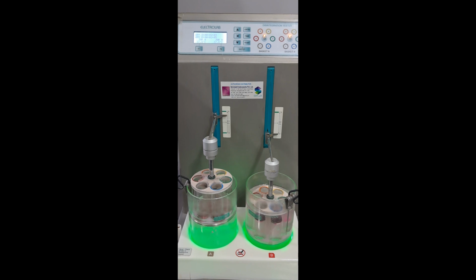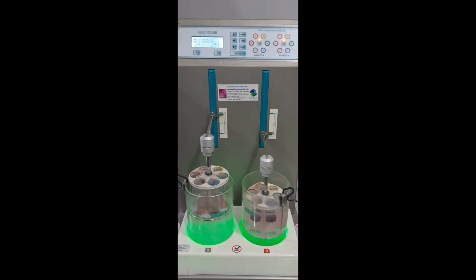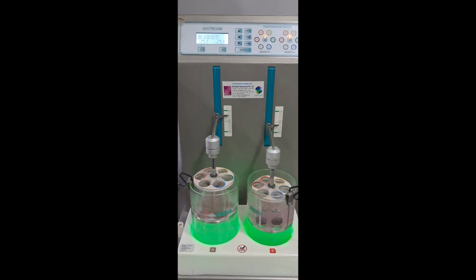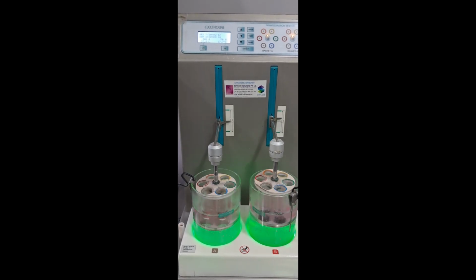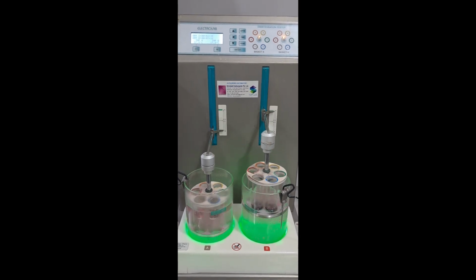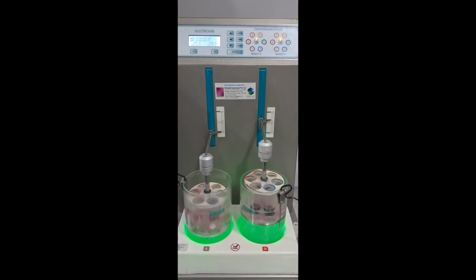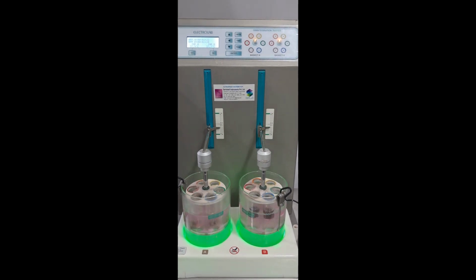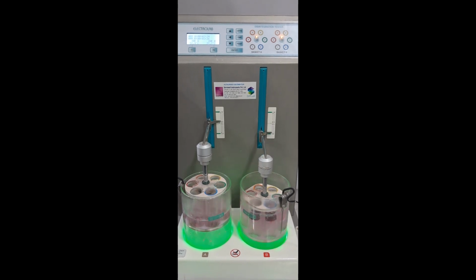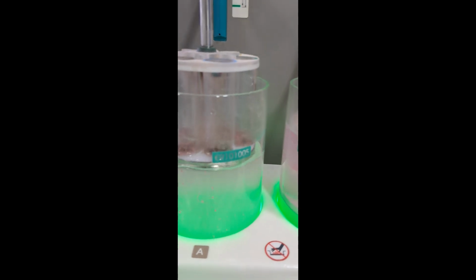Liquid oral preparations, syrups, suspensions, solutions. These are already in liquid form. Powders and granules for oral suspension or solution. While the individual particles might dissolve, the disintegration test as applied to solid compacts is not relevant. However, for granules intended to be dispersed, a similar concept of dispersion is evaluated.